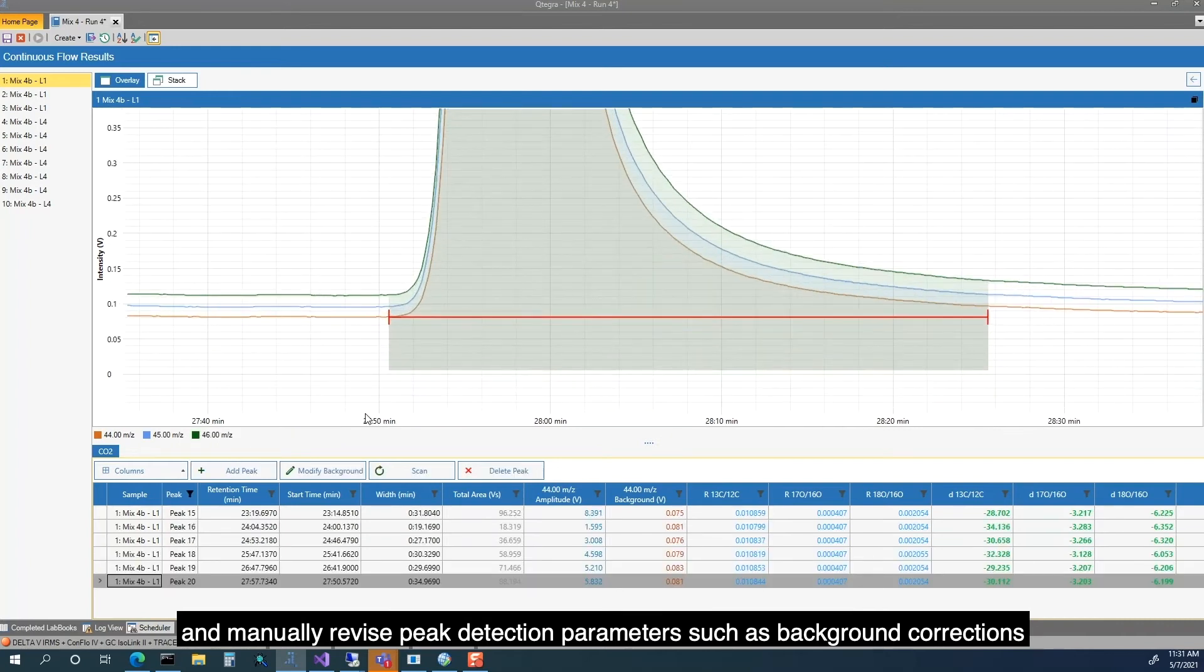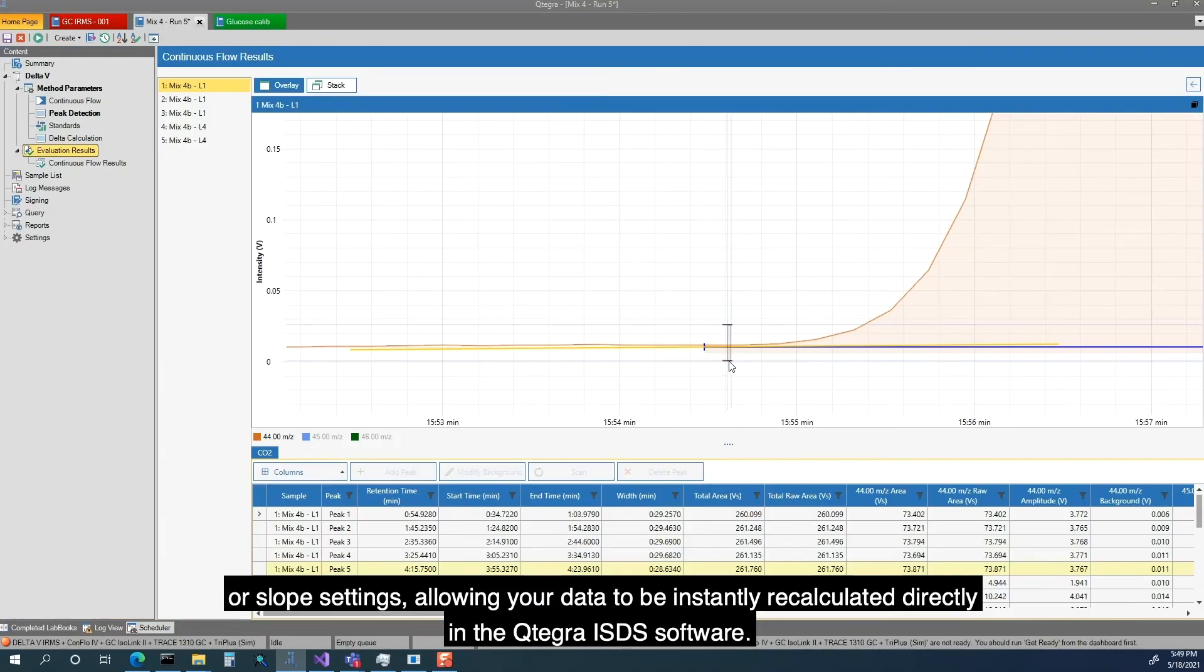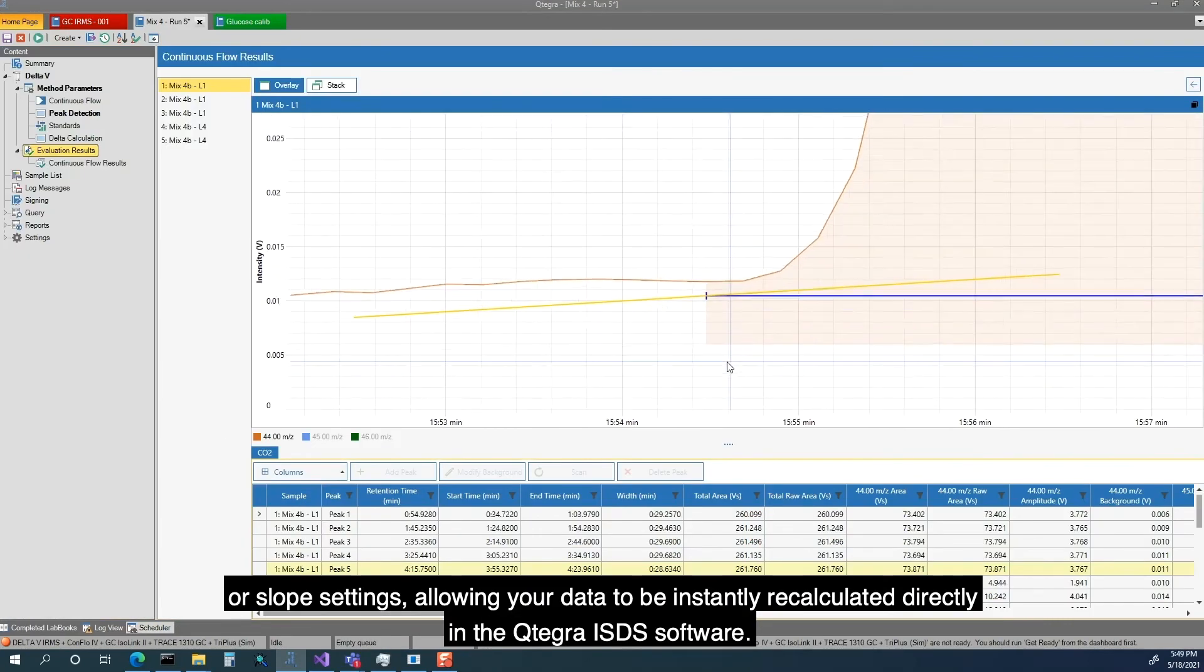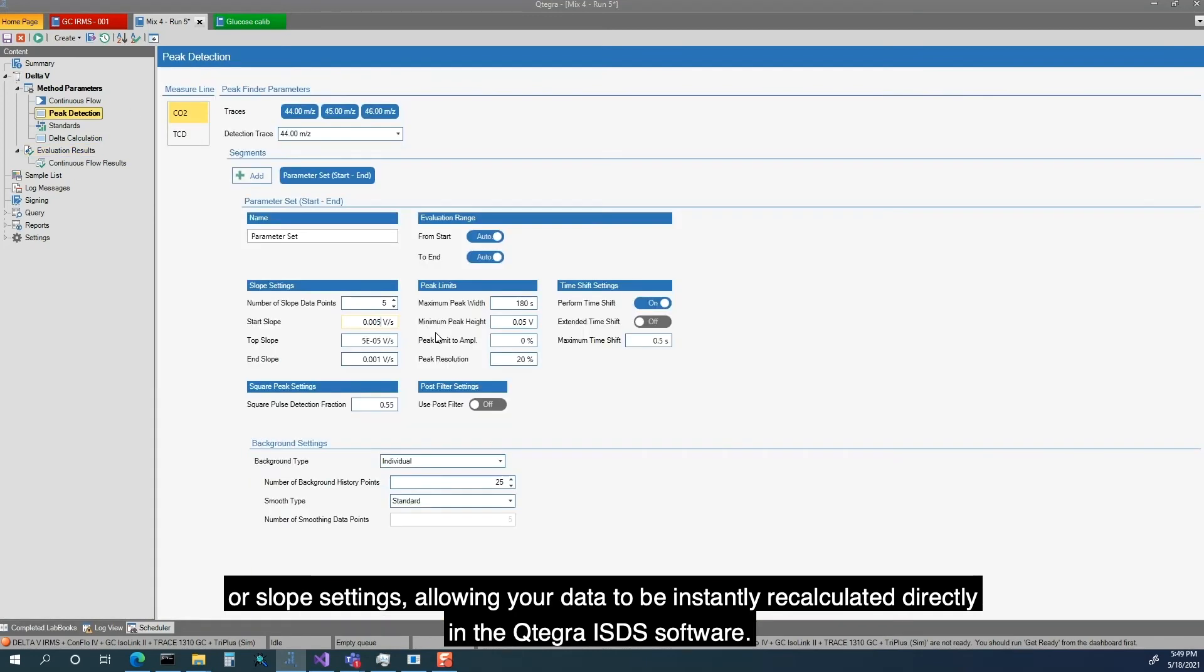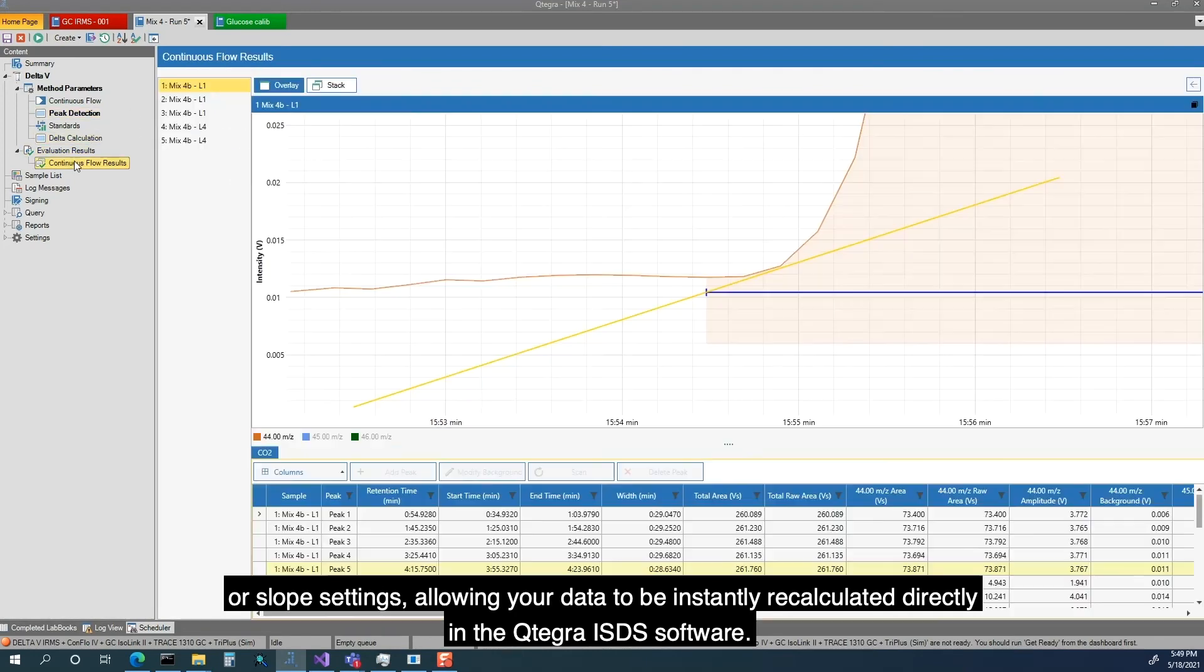Such as background corrections or slope settings, allowing your data to be instantly recalculated directly in the Cutegra ISDS Software.